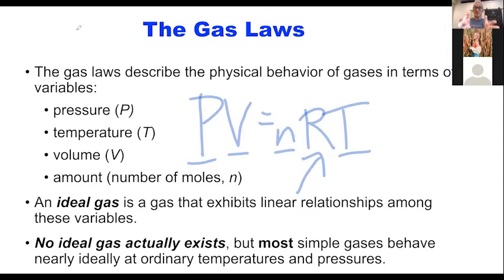And that's what you're going to do tonight. You're actually going to calculate the value of R. We pretty much know what the value of R is, so hopefully we're going to get fairly close, fingers crossed. And as mentioned, this is the ideal gas law.